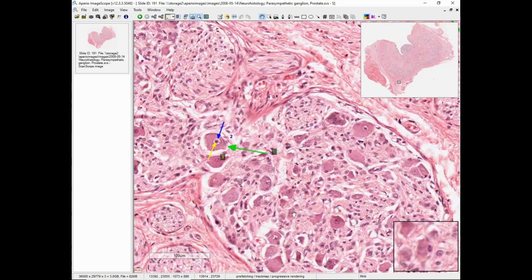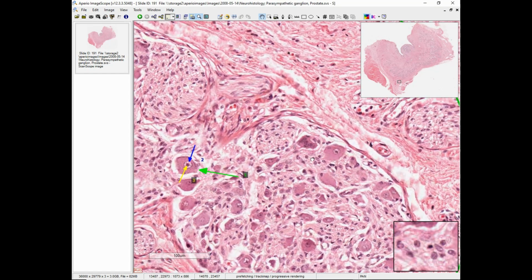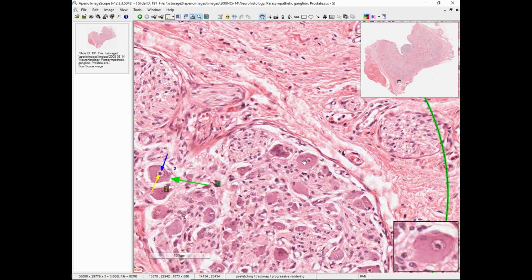Now, it's hard to see the axons coming and going because the axons are very thin and the nerve cell bodies are very large. But if you look at this one right here, you can see how it's forming a nice little spike at about 7 o'clock on the clock face. That could very well be an axon. This could be the axon hillock forming the axon, but I cannot guarantee that's what it is. So we're not going to say definitively, but that's possible. And last but not least, we also have little satellite cells hanging out around the periphery of these individual neurons.